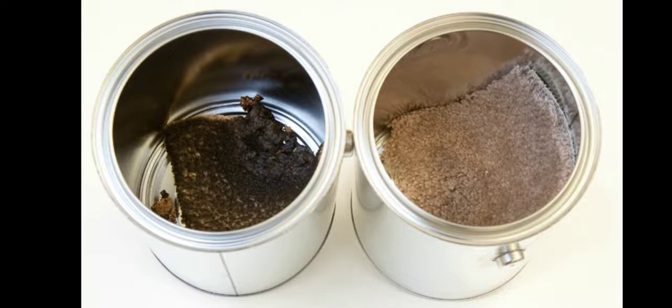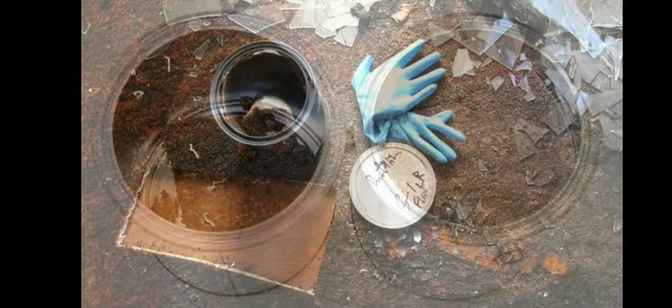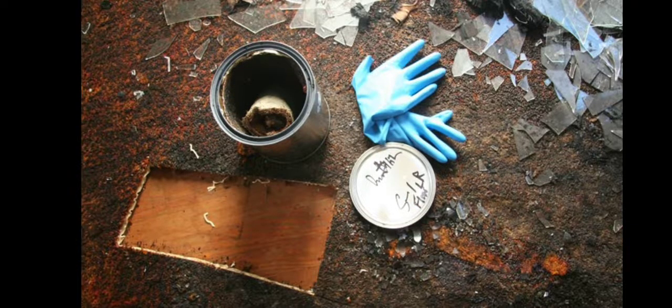If a comparison sample of similar debris or background information is provided, examination may be able to determine if the compound or compounds detected were naturally occurring in the debris substrate. For example, a questioned sample of burned carpet that may have had an ignitable liquid poured on it can be compared to a sample of the same carpet from another location outside the potential ignitable liquid pour.